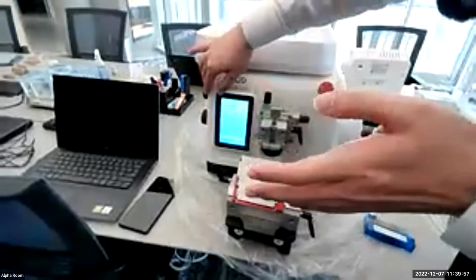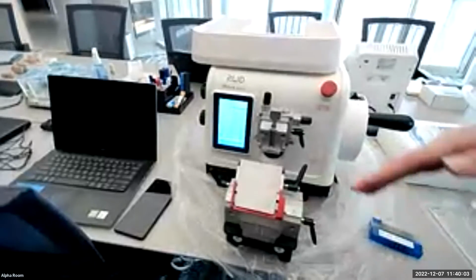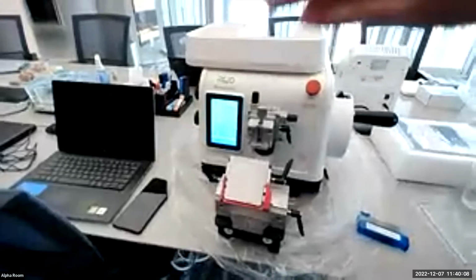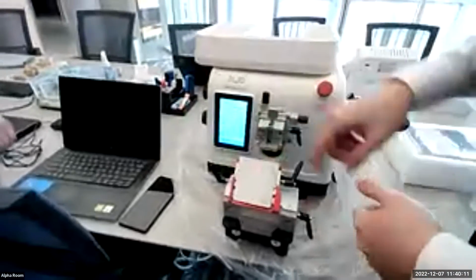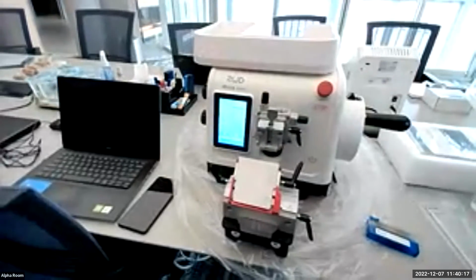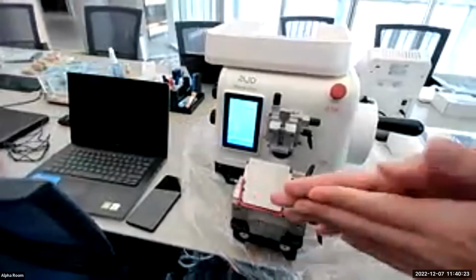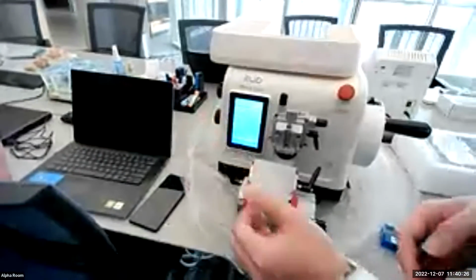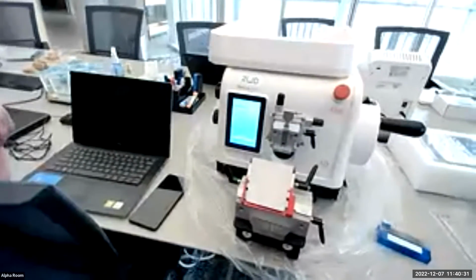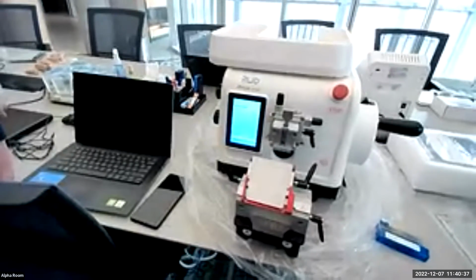We have 2000 error logs and operation logs stored, recording information changes and received information. You can see the details of the time and use the USB for all logs. Can we delete or reset the operation log? Reset, yeah, or delete. You can output the data, but we do not recommend deleting it. Oh, okay.